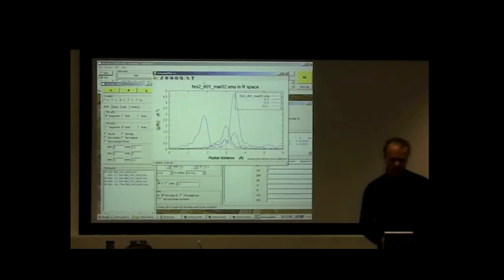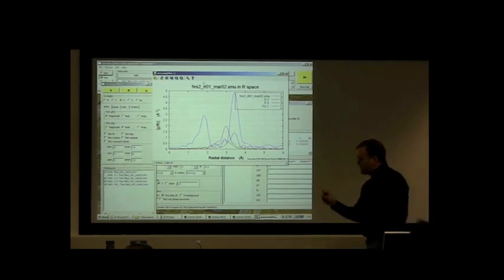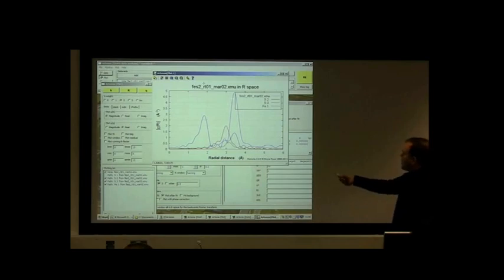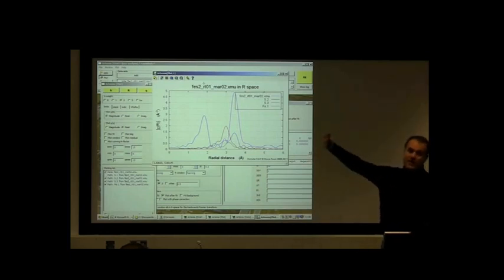Again, it's a little bit surprising to look at because all of the peaks are enormously larger than the data. But that just has to do with the fact that I haven't considered any values for sigma squared at all, so I haven't included any disorder yet. It's just the raw theory calculation, without any disorder, without any consideration of S0 squared. We're going to get there.